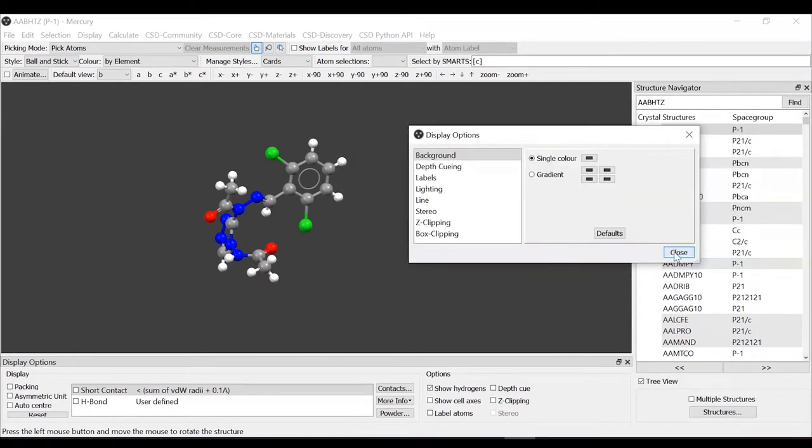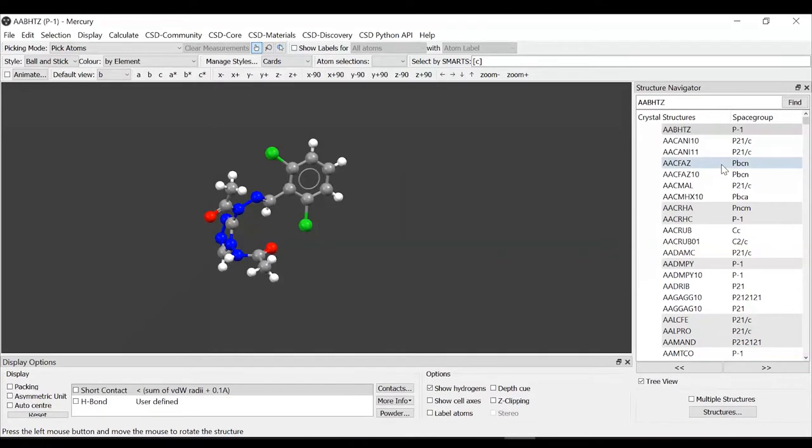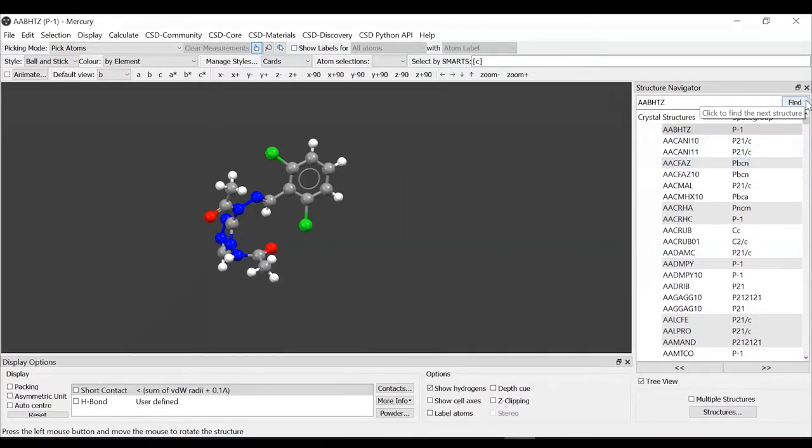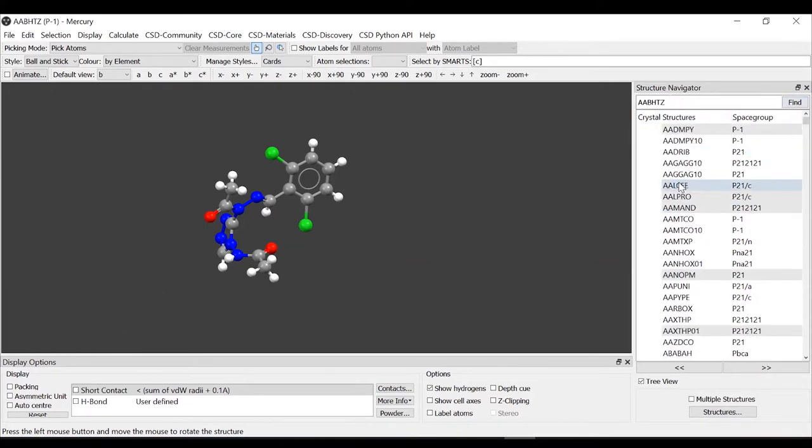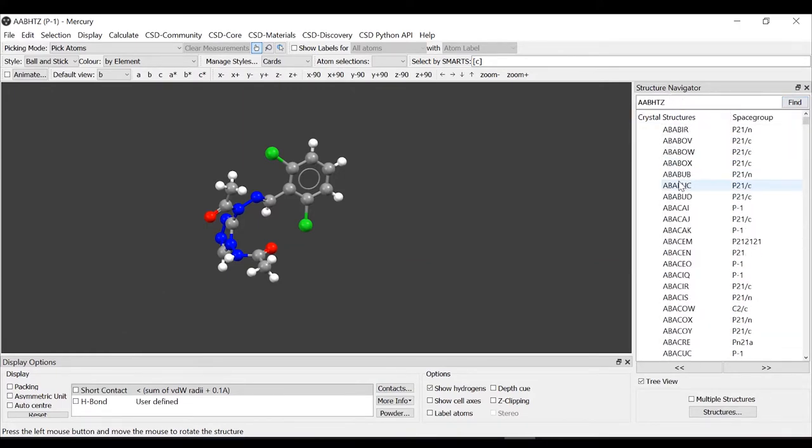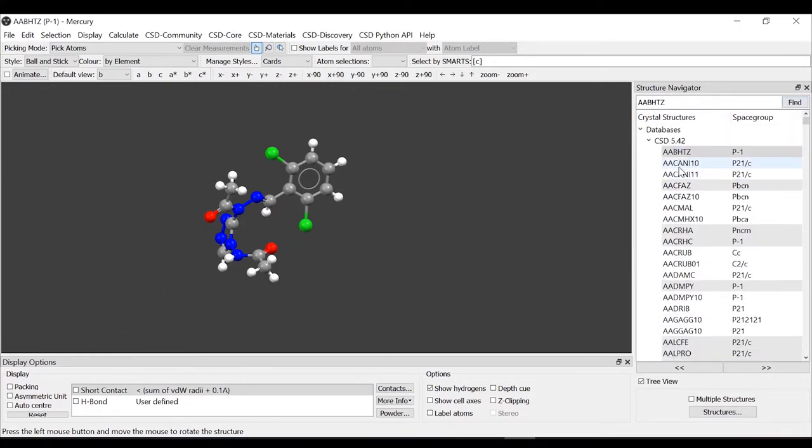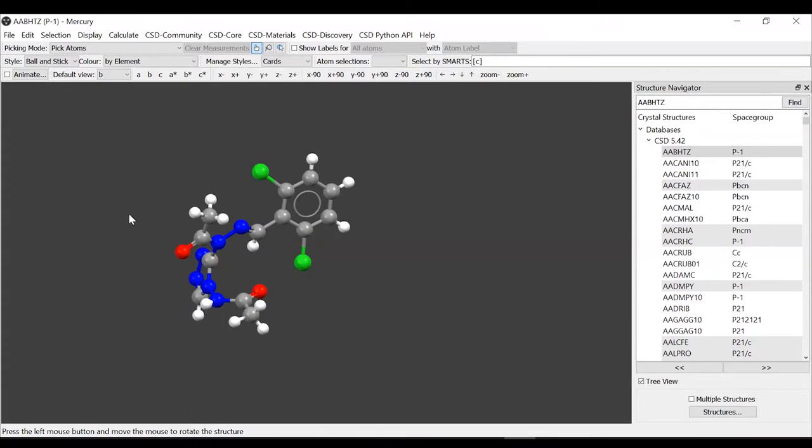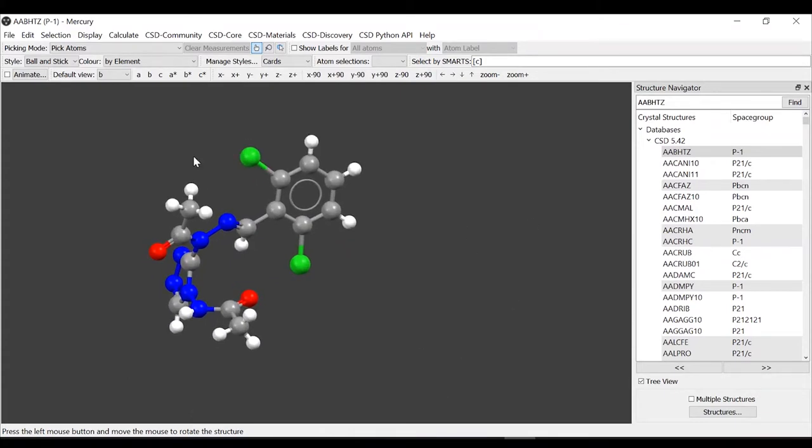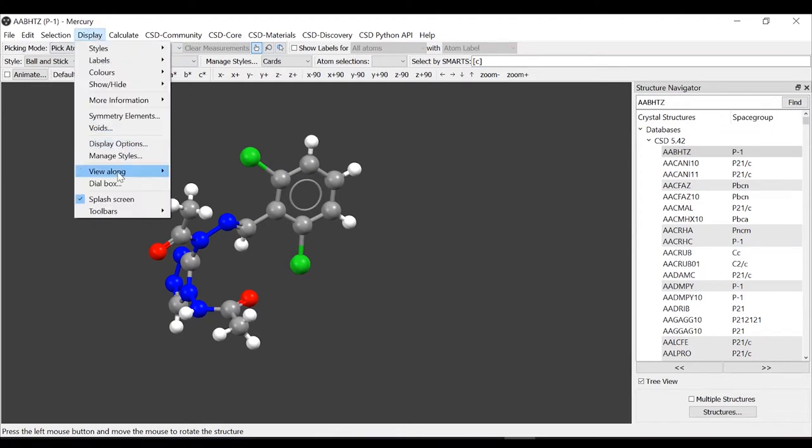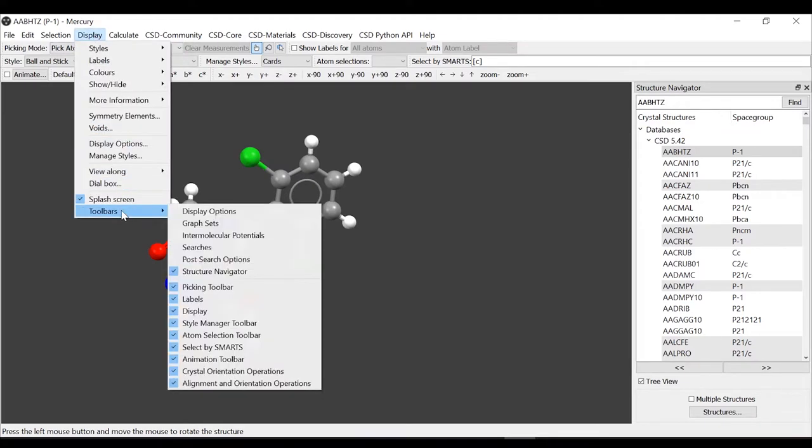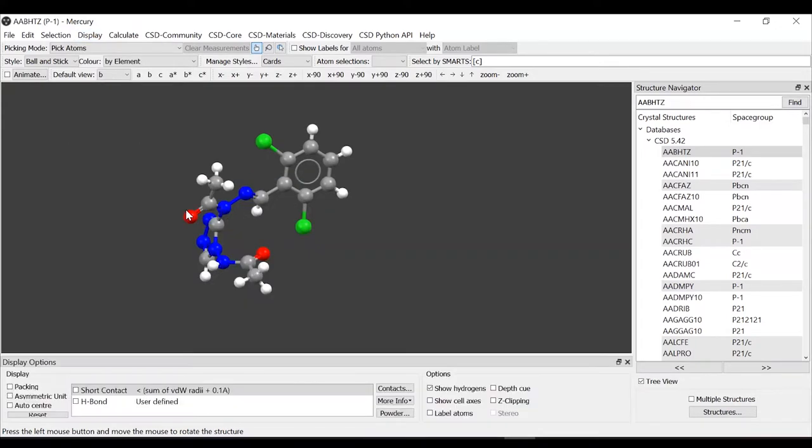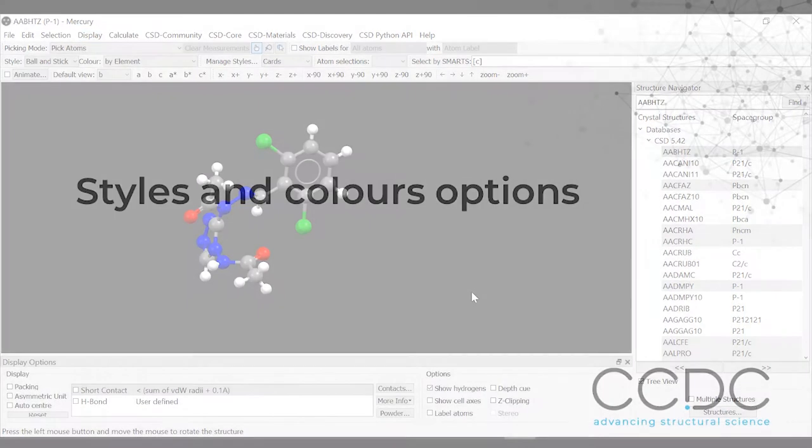We can move on to the other parts of the Mercury interface. We have this structure navigator on the right where we can see all the structures that are loaded. Here we will insert the refcode of our structure. We will use some of the display options here at the bottom. If we close it, maybe we don't need it, we can always restore it from display toolbars.